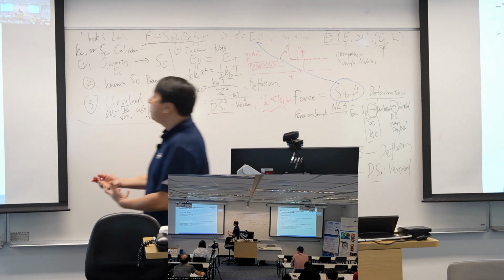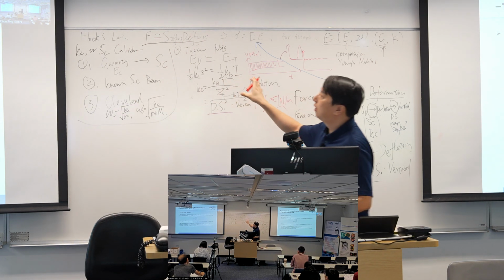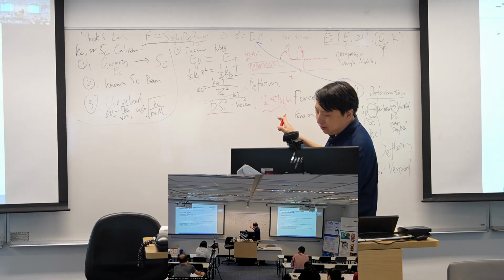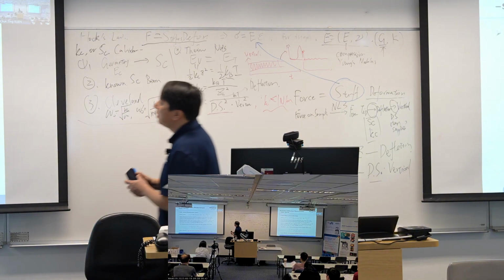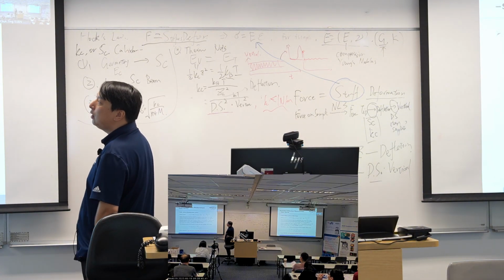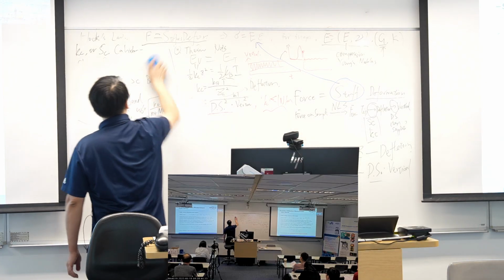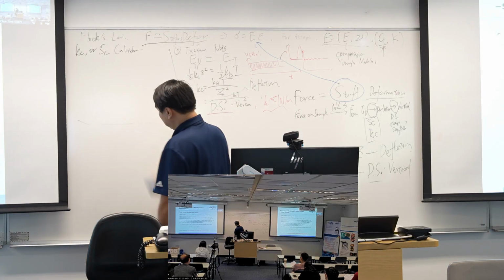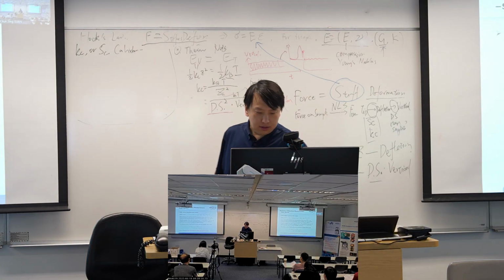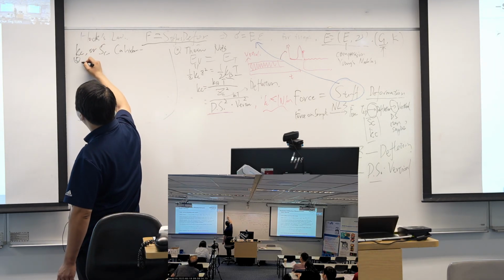And there's another way that can be used to calibrate the spring constant, developed nearly 20 years ago by Professor Sader.